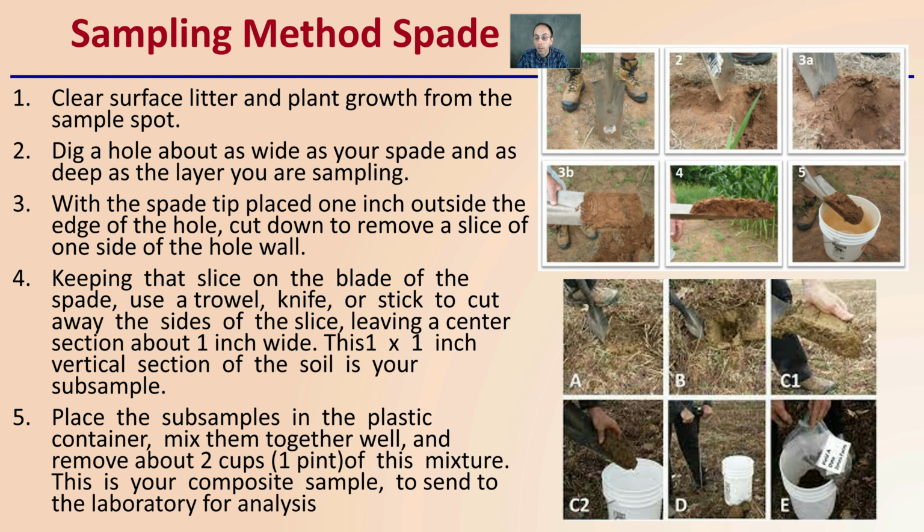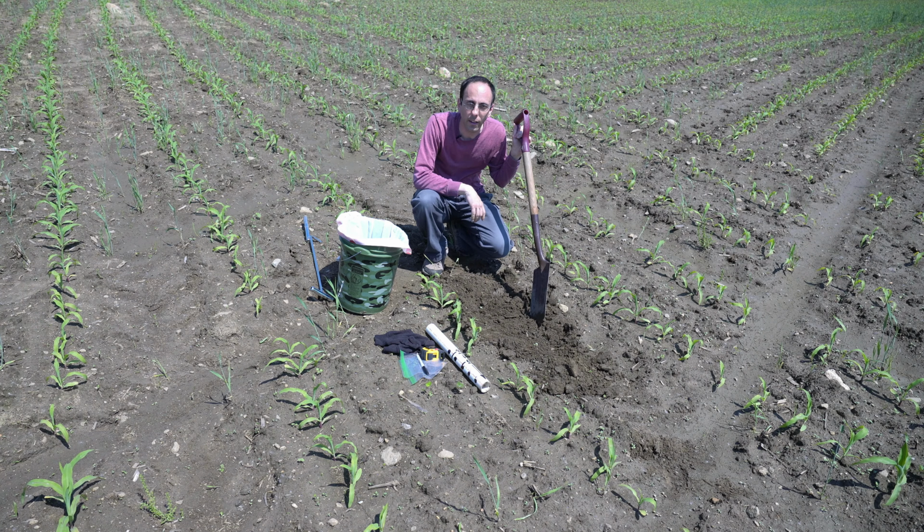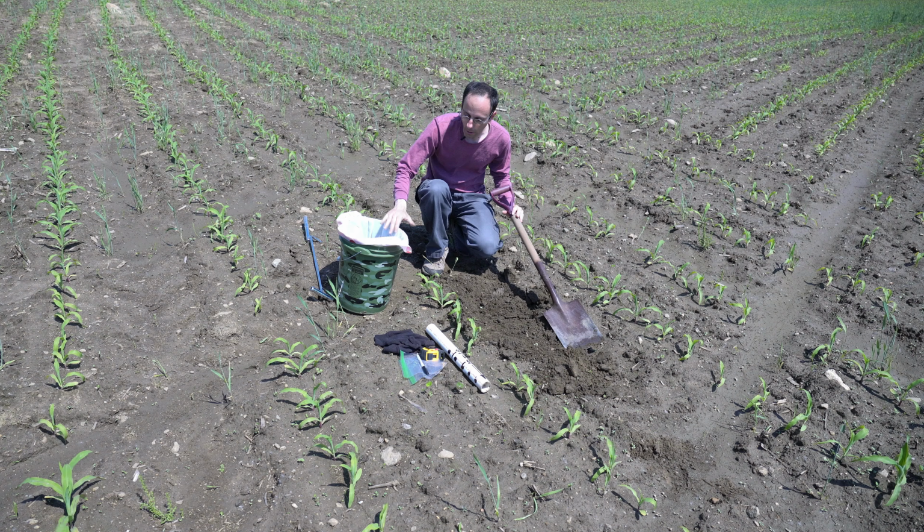And we can see enough moisture in the soil here. Take that core, that profile, add that to our bag, go back through, refill this in so we don't trip over it in the middle of the night, and then replicate that again and again. When we're done, we've got all of our soil.